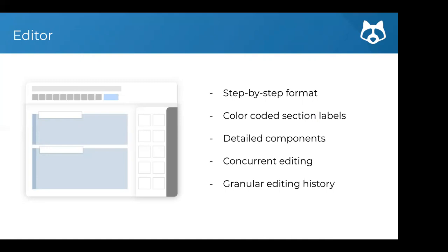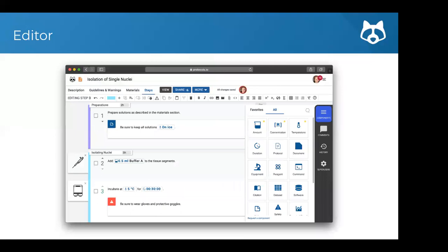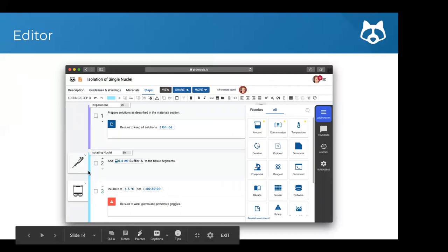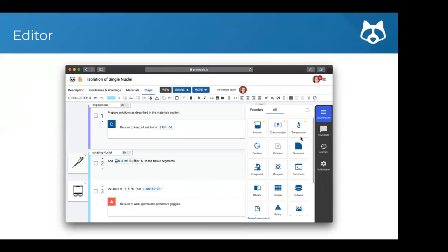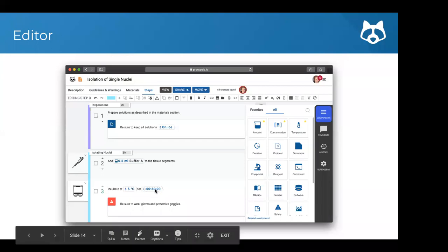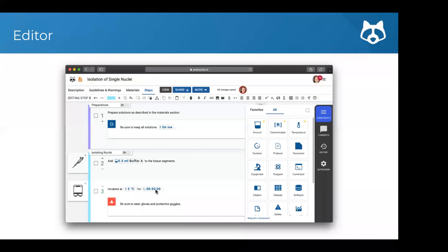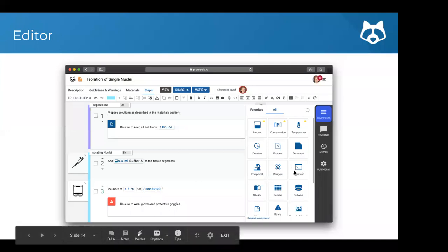There's also a granular editing history so you can see exactly who made which changes and when. Inside the editor, you have individual steps, sections with icons, and components on the right side. Components are really great especially for the run functionality — for example, using the amount component lets you scale the protocol. If you scale by three, it would tell you that you need one and a half milliliters of buffer A instead of half a milliliter. The duration component gives you a timer that pops up.